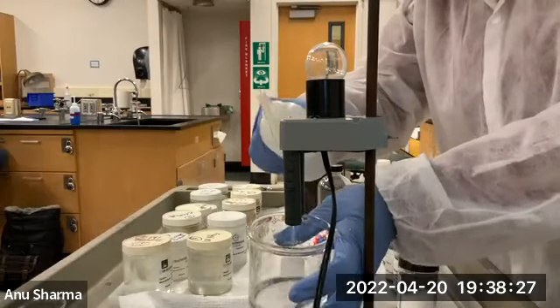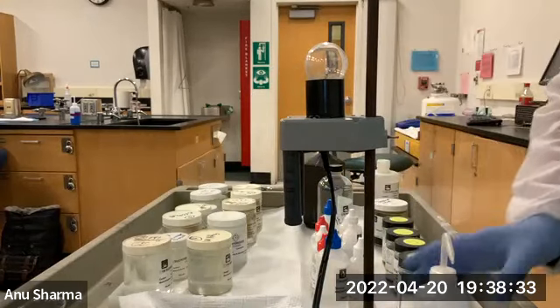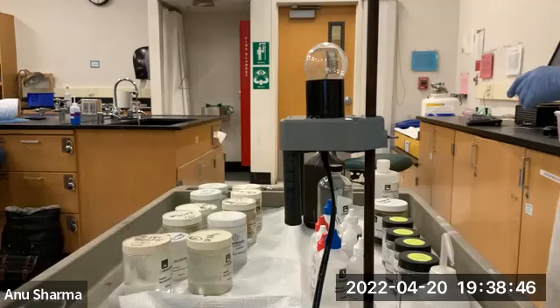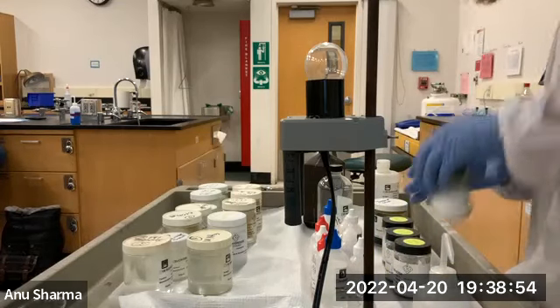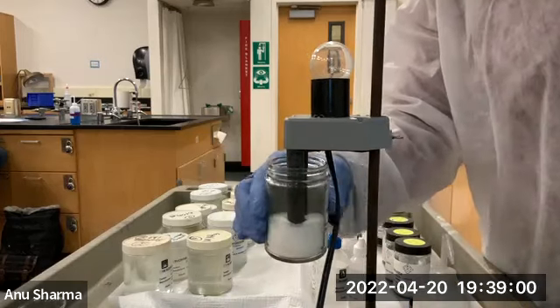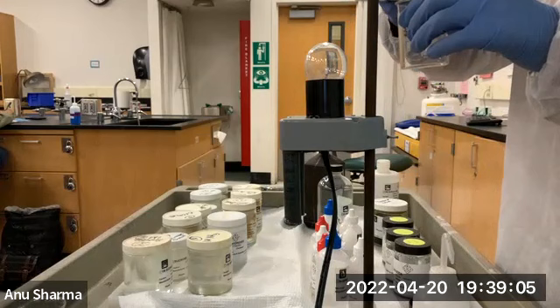Now, let's look at the next table, which is the test of the household samples, the baking soda. Solubility in water. We take the baking soda and we see whether it's soluble in water or not, and whether it will conduct electricity or not. Obviously, when it is in a solid form, it won't conduct electricity. You mix it in water and then you'll see whether it will or not.